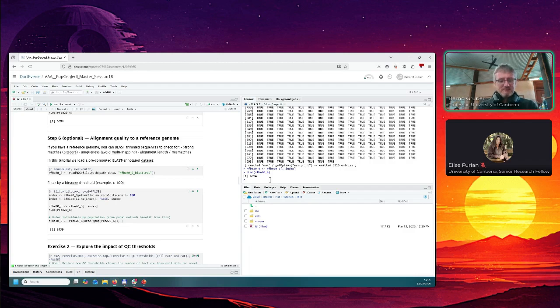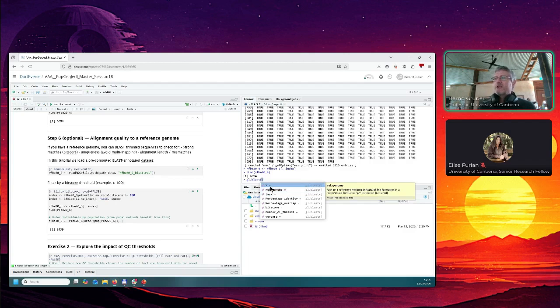We're not running a blast here because it takes a while. It's the gl.blast function, if you want to know. It takes the arguments reference genome and your genlight object, and you can put in some other values to look for quality. Basically, we do that later, so you don't need that.